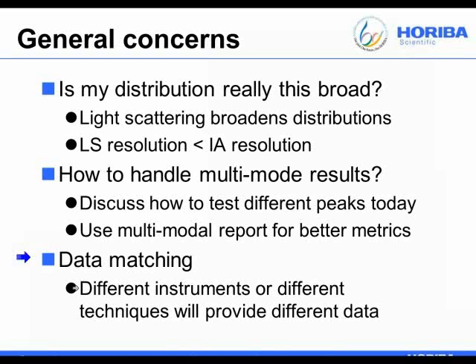And then data matching is a topic all unto itself. We'll get into that a little bit at the end of the presentation today, especially when we discuss the CAMSIZER and matching sieves. But it is generally a truism that different instruments or different techniques will provide different data. And that's not something we as instrument vendors do because it makes for a good business. It's just the nature of the beast.